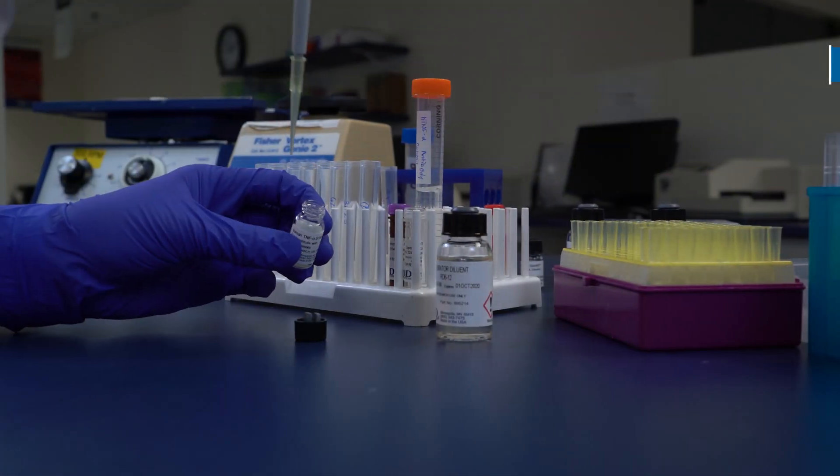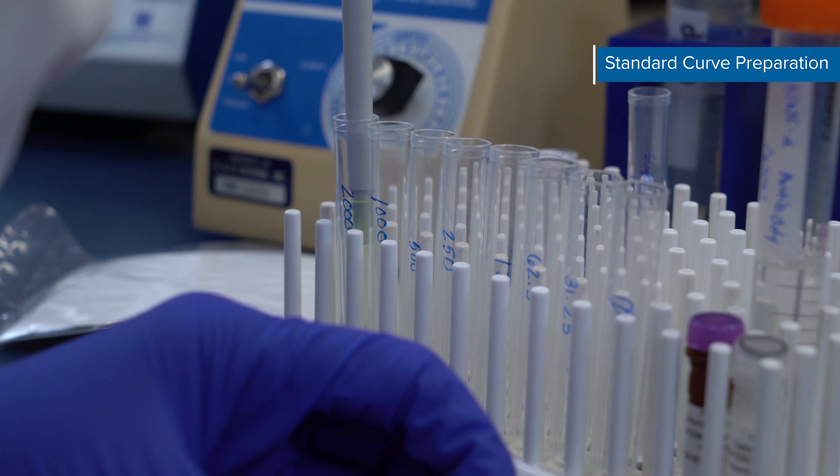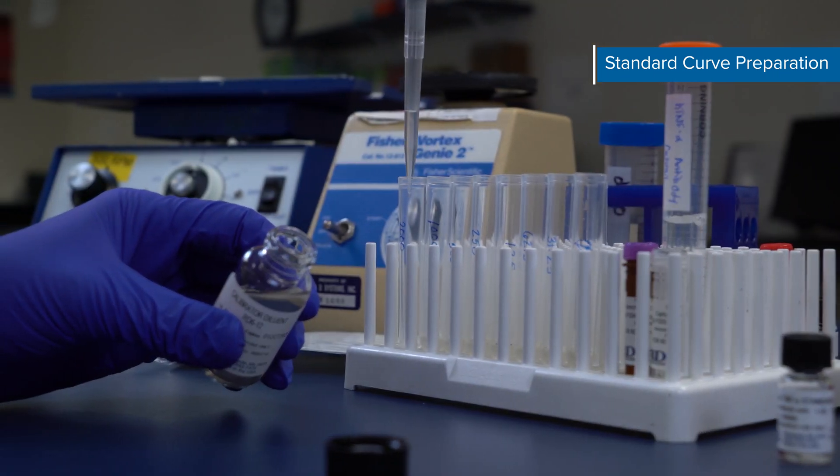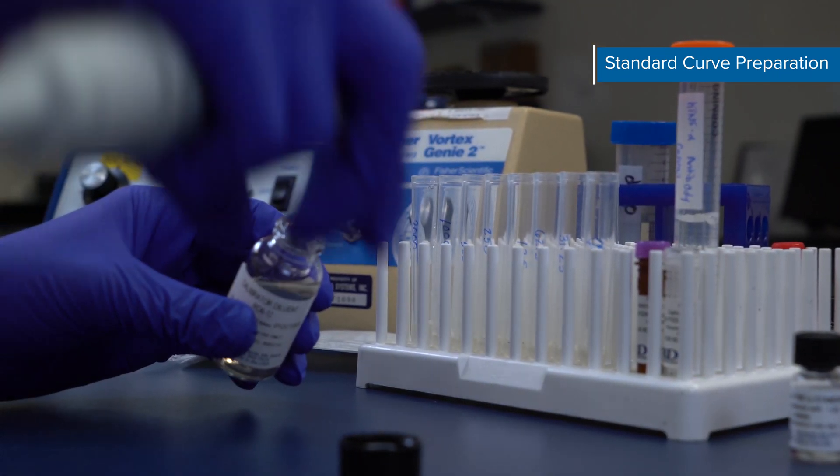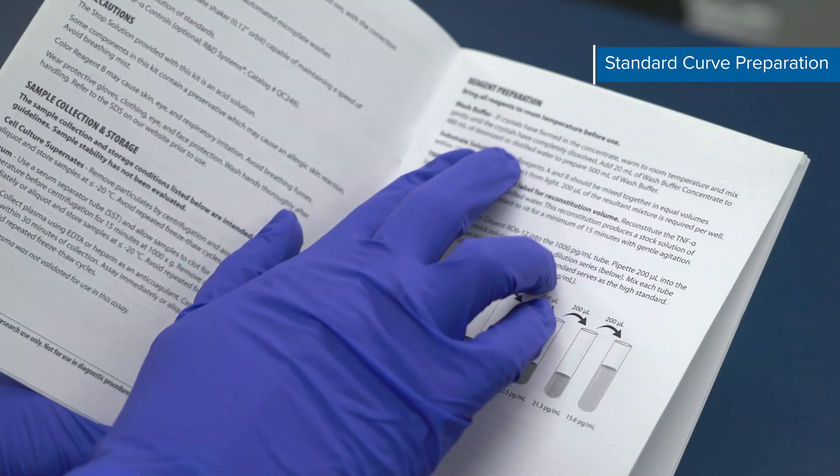It's time to create the standard curve. Pipette 50 µL of the standard into the 2000 pg per mL tube. Then add 450 µL of the calibrated diluent into the same tube. This creates the high standard. Vortex gently to mix.